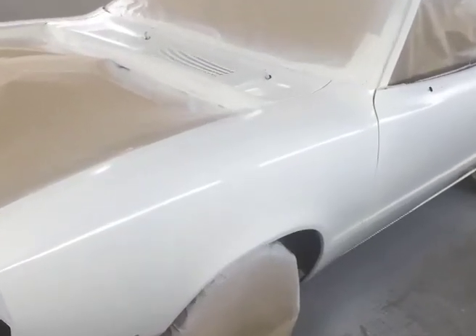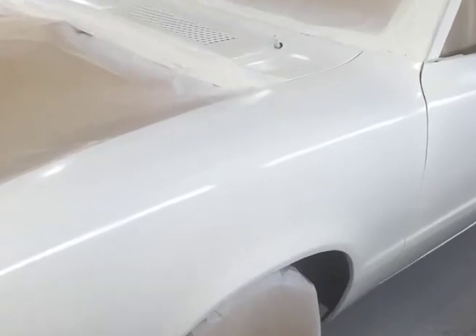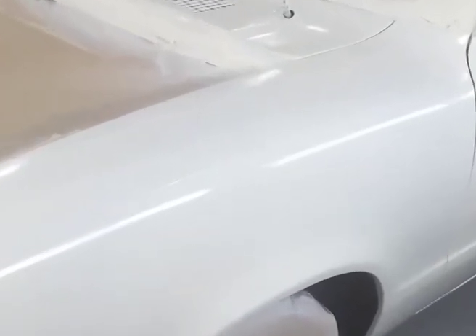An old repainted vehicle may have differences in layers in different parts of the same vehicle. Therefore, non-matching of layers does not always eliminate the possibility of two paint chips originating from the same vehicle if they are found to be similar in other confirmatory tests. The brittle paint chips are sectioned with the help of a microtome for comparison under a comparison microscope. Let us understand now in brief how a microtome works. The paint layer structure can be seen by cutting through the sample with a scalpel blade at an angle.